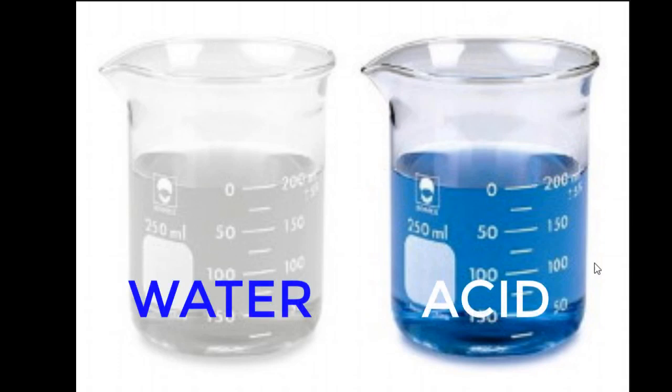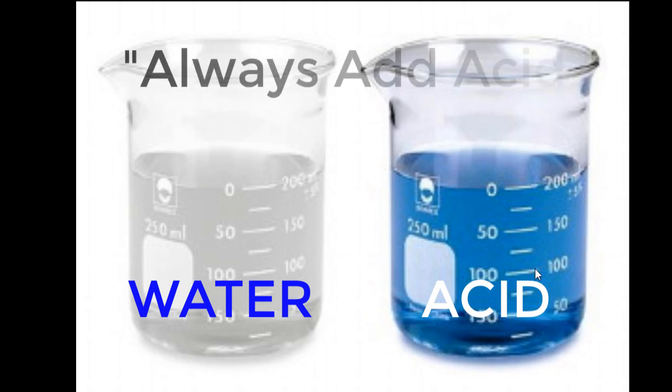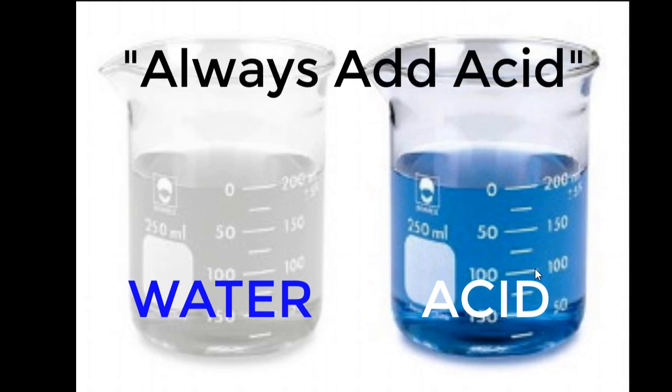Okay? You always want to take this and add it to this, not add the water to the acid. And the reason for that is you want to be able to control how fast the liquid's flowing. And the second thing is you want to control what splashes.